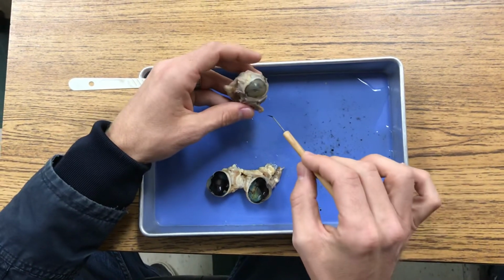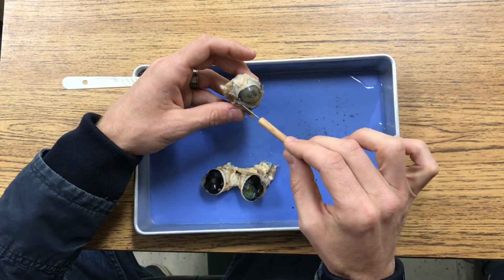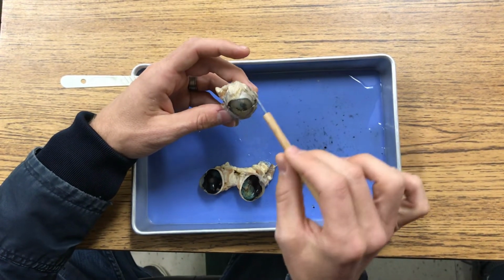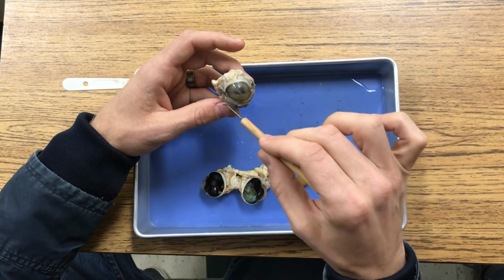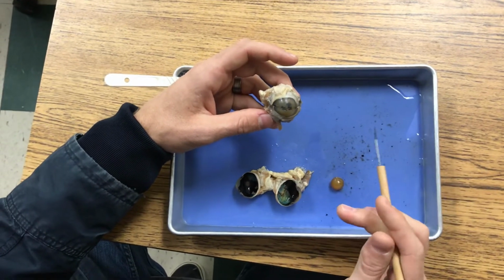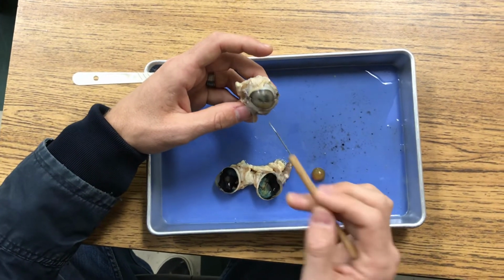And then you have this muscle here, which kind of wraps around the eye. This is called the inferior oblique, and the superior oblique would come across this way, but it's not there. But these, again, wrap around the eye to stabilize the eye when you look up or look down. It holds it in place or pulls it out so that your eyes don't get covered when you look up.